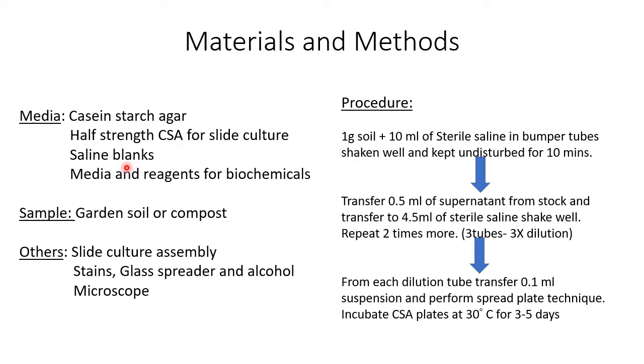Okay, then saline blanks, then media and reagents for biochemicals, garden soil or compost, sterile slide culture assembly, stains, glass spreader, alcohol, and microscope.